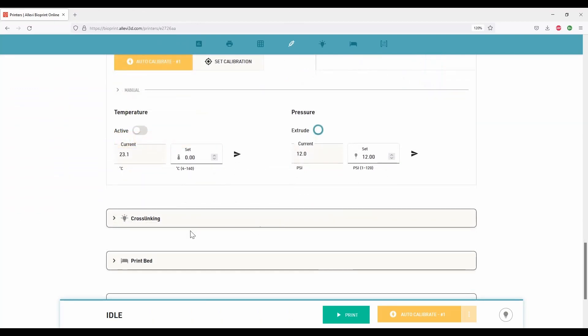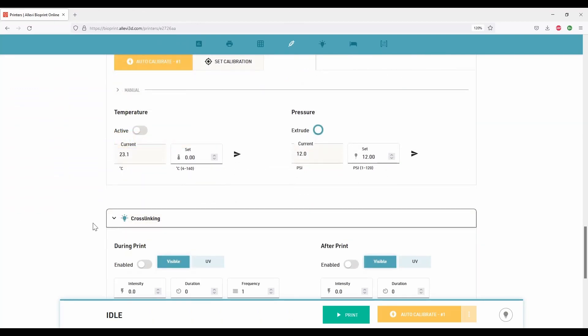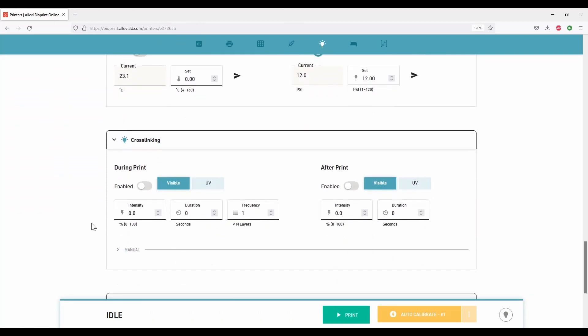Next step is crosslinking. If your ink needs photo crosslinking, choose the method that suits your need. Choose from crosslinking during the print or after the print. Choose from visible light or UV light. The intensity, duration, and frequency can be adjusted as needed.